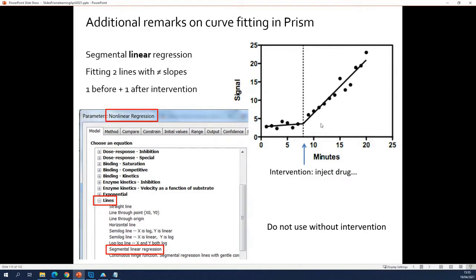That allows you to fit two lines to your data. One before and one after the intervention.